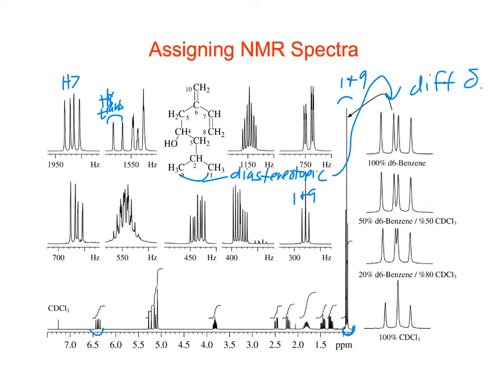We slide it across, it doesn't match that, doesn't match that, but kind of matches in here. At least something in there has to be H8 cis, but I think there's more overlapping than just this. So something in here is H8 cis.